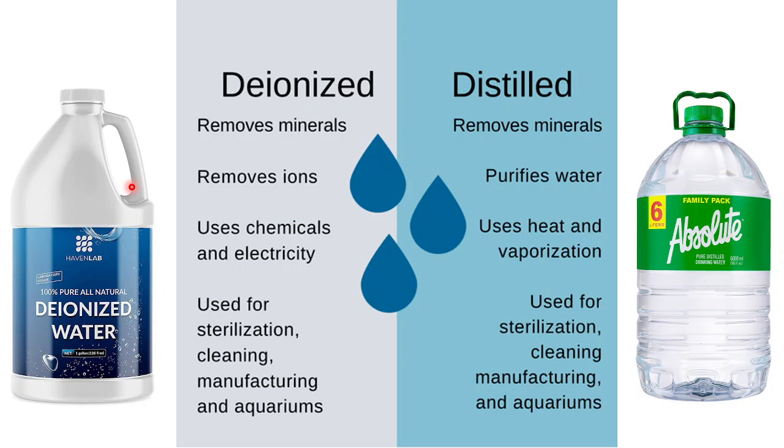Now, kining deionized water, these are a type of water in which the ions are already removed. Kanang walay ions, katong mga cations, mga anions, from the word deionize. No? So, lahi ang distilled water, lahi pod ang deionized water.